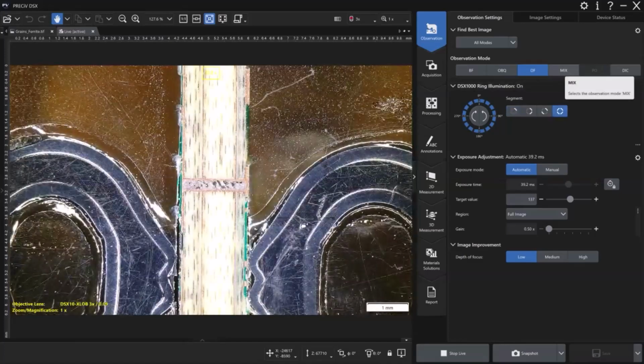One thing when you're using the proprietary mixed illumination, this is available on a lot of the Olympus frames, like our BX or GX upright compound microscopes, using a mix slider. The digital microscope also has this built in for mixed illumination.